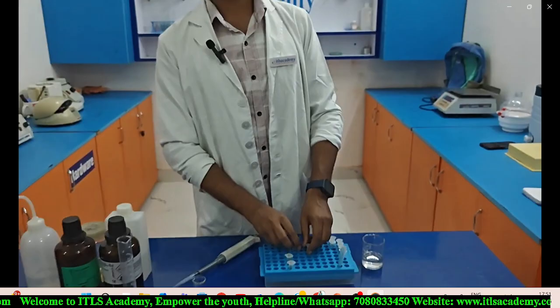for a further 10 minutes. So after performing the centrifugation, as you can see there are pellets and the supernatant. Now what I'm going to do, again the same procedure, we need to discard the supernatant. But one additional thing which we need to do here is that we add 70% chilled ethanol before centrifugation.